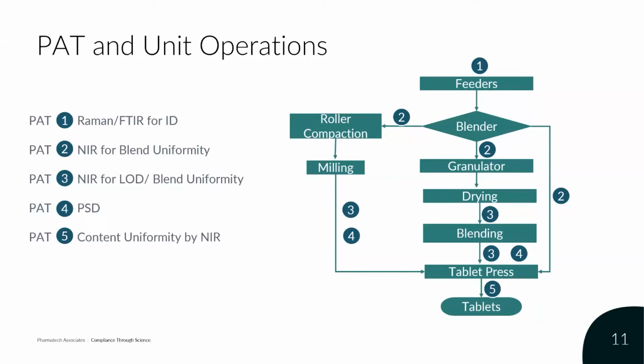is placed in a specific point in the manufacturing equipment that continually monitors and gives you process results in real time. You can have them online, where a portion of the batch is segregated and then tested very near to where the manufacturing is occurring. Or it could be at line or offline, where samples are taken and sent to the lab.